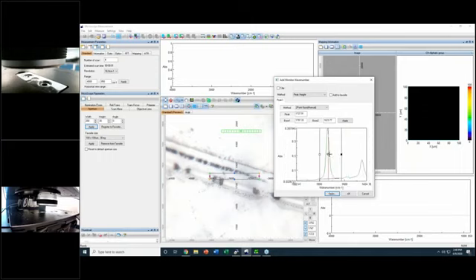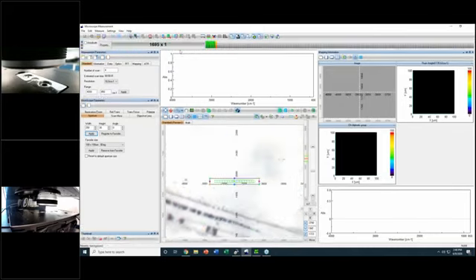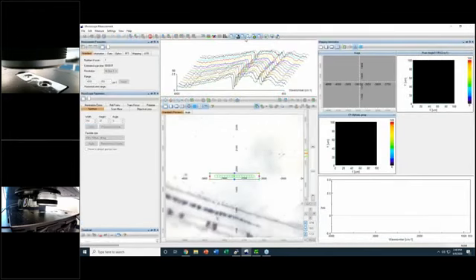If I select the specific desired functional group, click OK, I can take the background. We can see the background of all the elements that are doing the measurement.